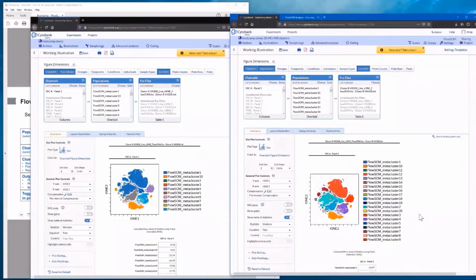And you can see that increasing this number of metaclusters looked more beneficial in assigning different metaclusters to each of our separate viSNE islands. Perhaps we could go up from here a little higher as well, as these two distinct islands are the same color. We can download the results for this run as well if we wanted to.